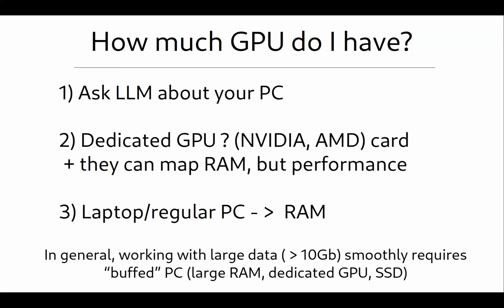So a lot of people say, okay, BigVolumeBrowser is kind of Imaris for master students, which is partially true because it's comparable in the ways that it handles 3D data. But all these commercial packages for 3D visualization usually go with a special dedicated PC. They sell you the program and they sell you the PC because they know that handling data in 3D requires a lot of processing power.